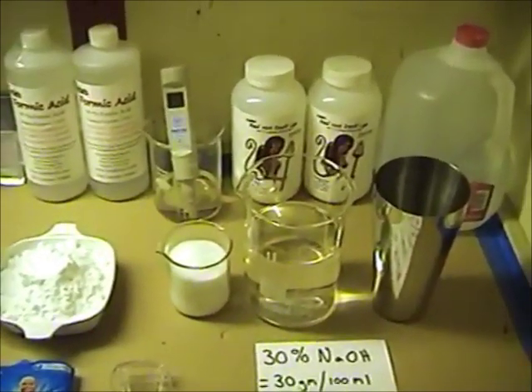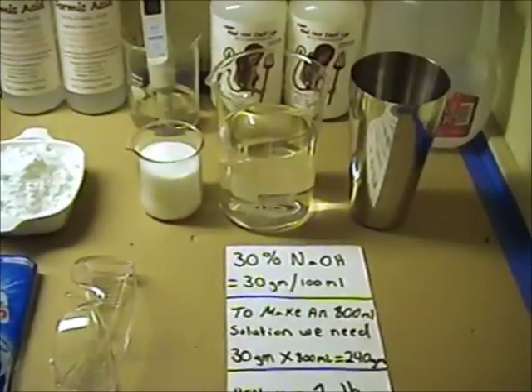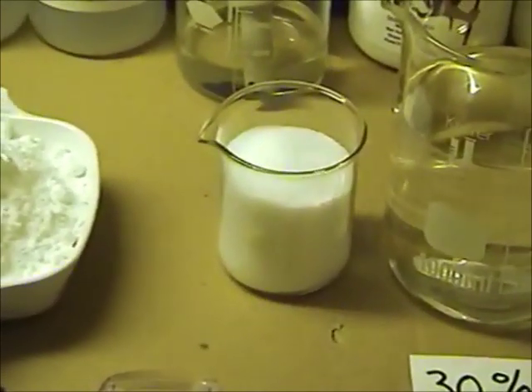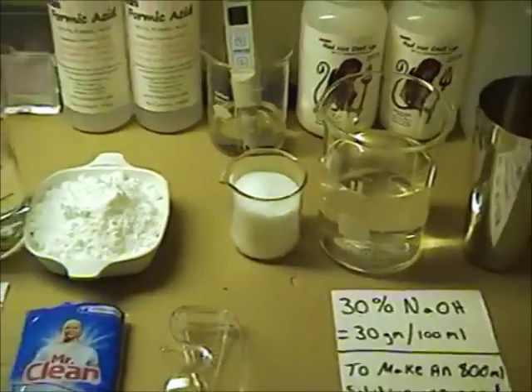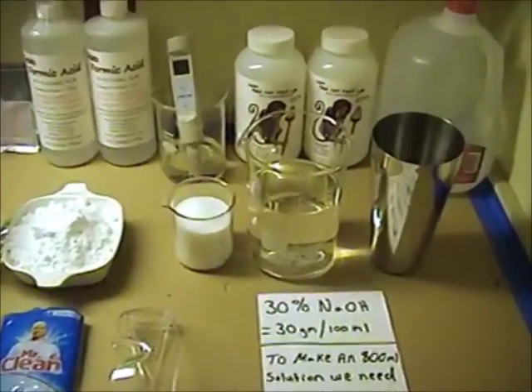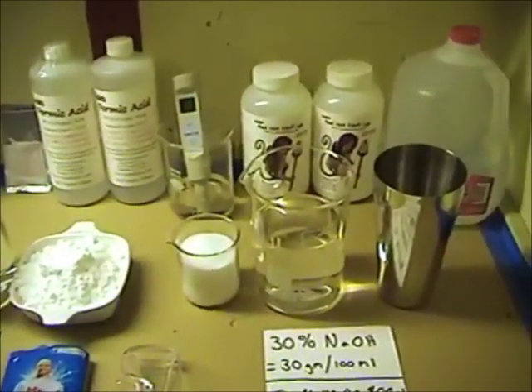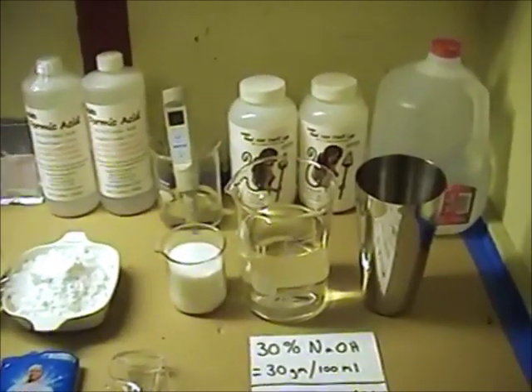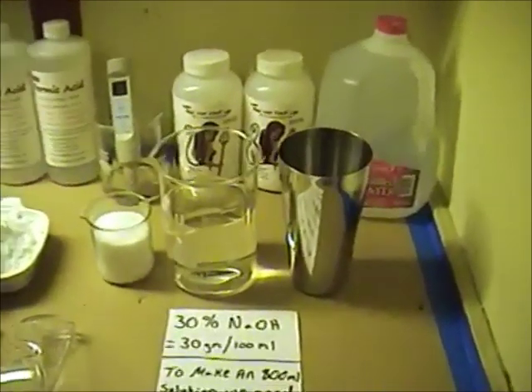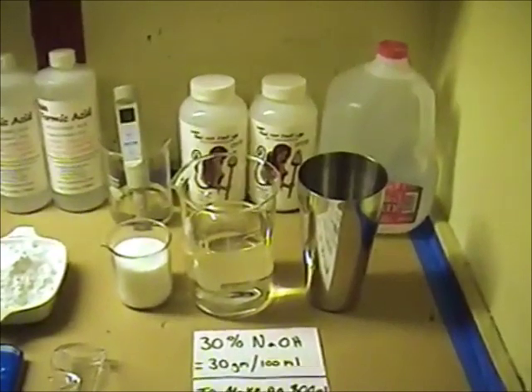So, in other words, they're dissolving human body parts and flushing them down the drain using the sodium hydroxide technology, and kind of what I just explained to you about the difference between acids and metals and bases in organic material. Now, you'll see here in front of me that I have a beaker of water, and over here a beaker with the exact amount of sodium hydroxide that we're going to need to make up our solution. But sodium hydroxide will dissolve glass. You cannot do this in glass, but what you can do it in is stainless steel. Sodium hydroxide will not harm stainless steel.